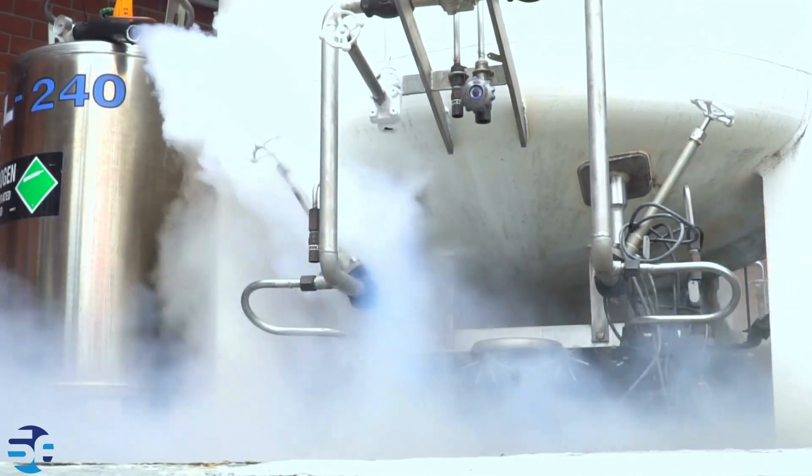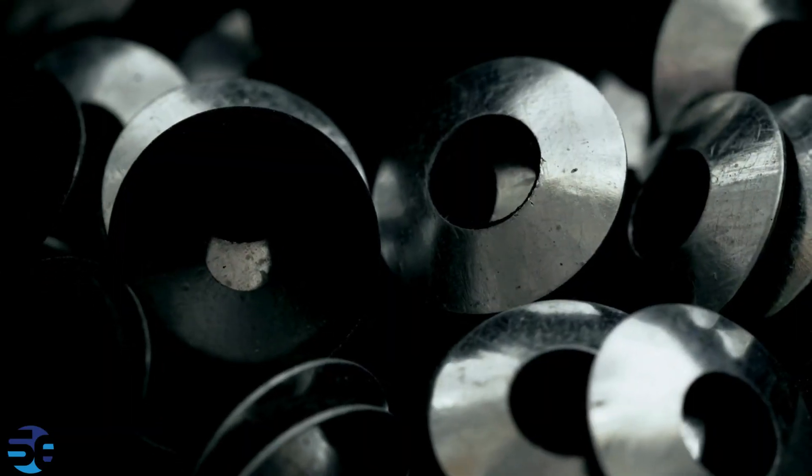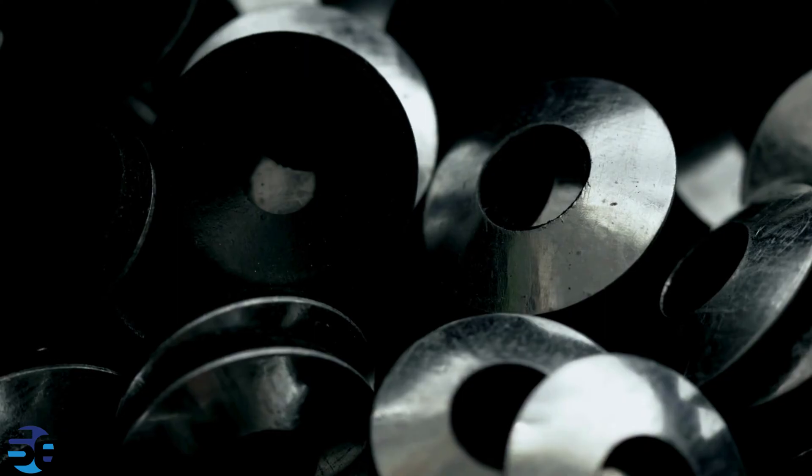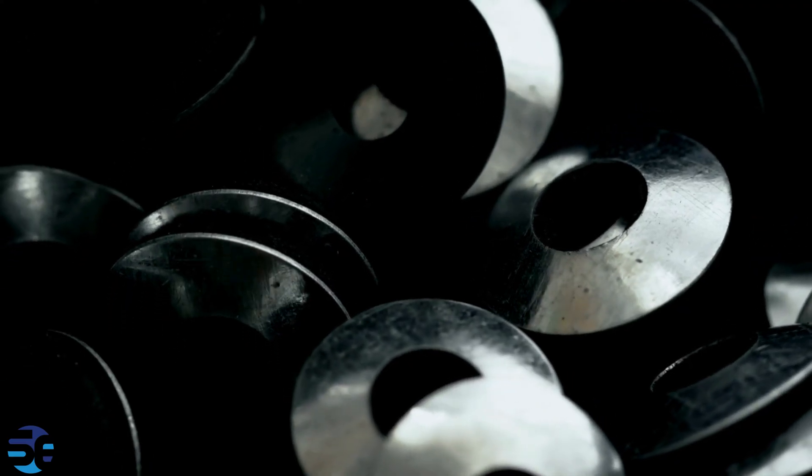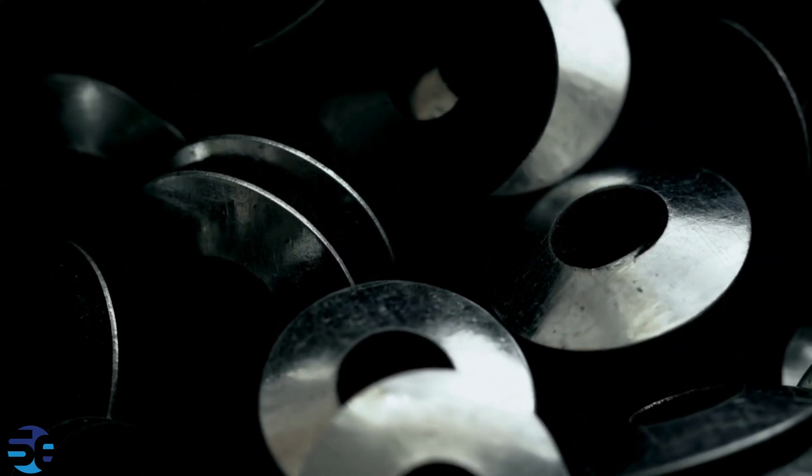Let's understand the sealing mechanism. The autoclave reactor is designed to have a secure sealing mechanism to prevent leaks or release of the high-pressure contents. Seals may include O-rings, gaskets, or other specialized mechanisms, depending on the design.